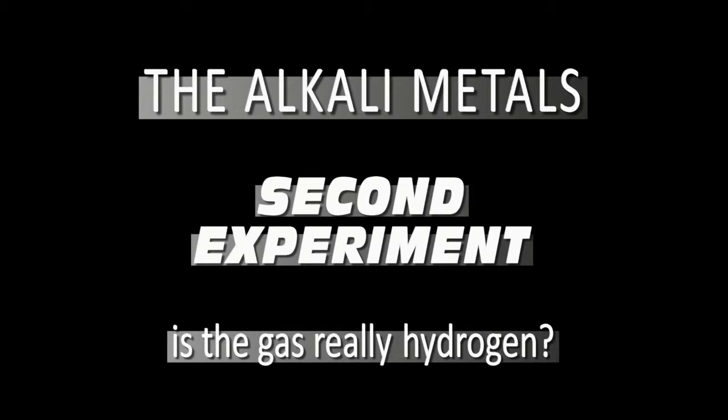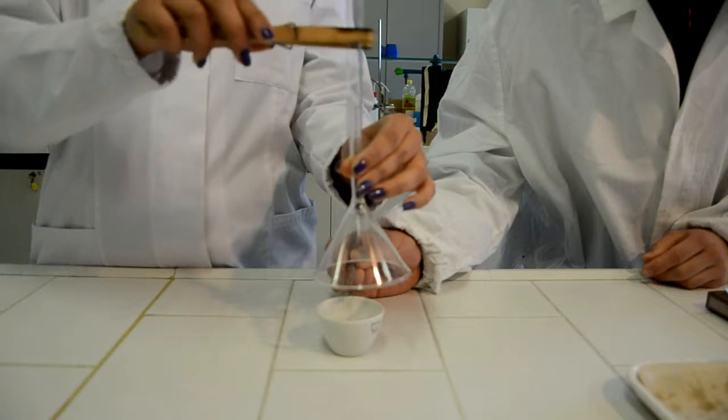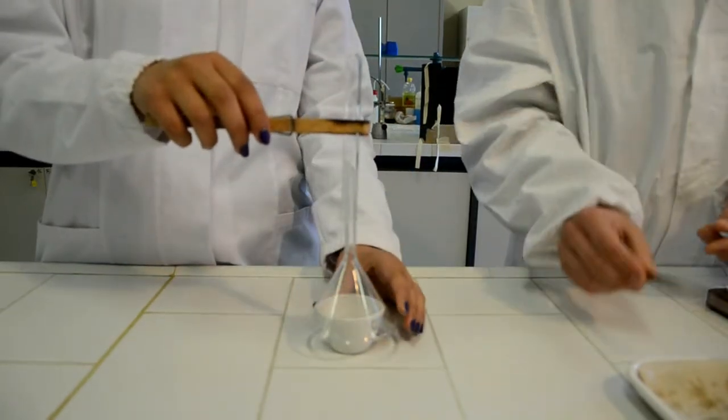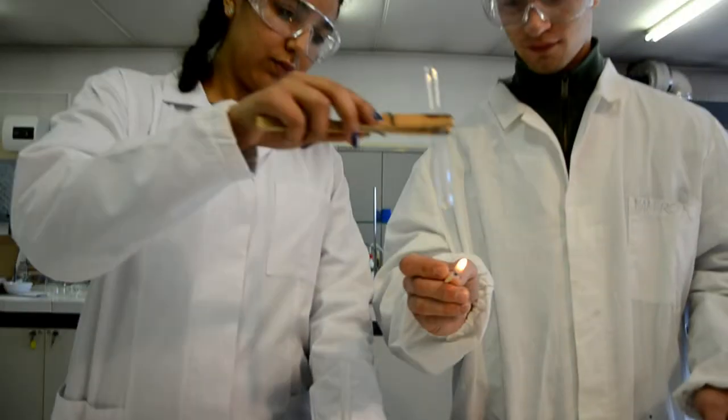How are we sure that the released gas is hydrogen? We collect the gas with this device. In this way, gas bubbles released during the reaction can be collected into the test tube. Moving the test tube very carefully, let the gas meet the air, which means oxygen, and by a spark cause the reaction. This noise is typical of hydrogen and proves that energy has been released. And the test tube looks steamy because the reaction product is water.